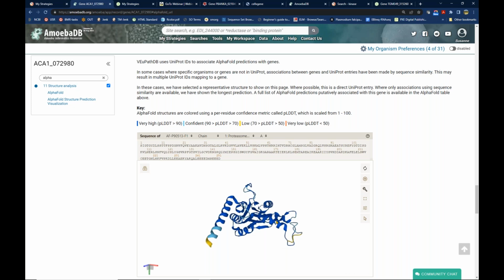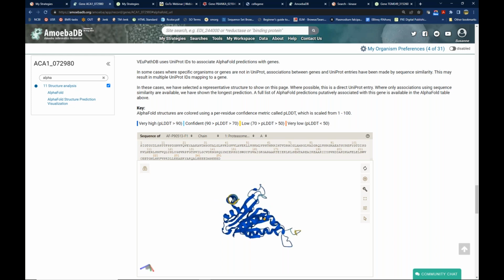Its protein product structure is here. You can hover over any amino acid here, and it'll show you, like that's turning red down in the structure, and vice versa. You can hover over the structure down here and see a red highlight in the sequence above. And then there are other things that you can do. If you're interested in this, you can learn more at the AlphaFold site on how to use their visualization.